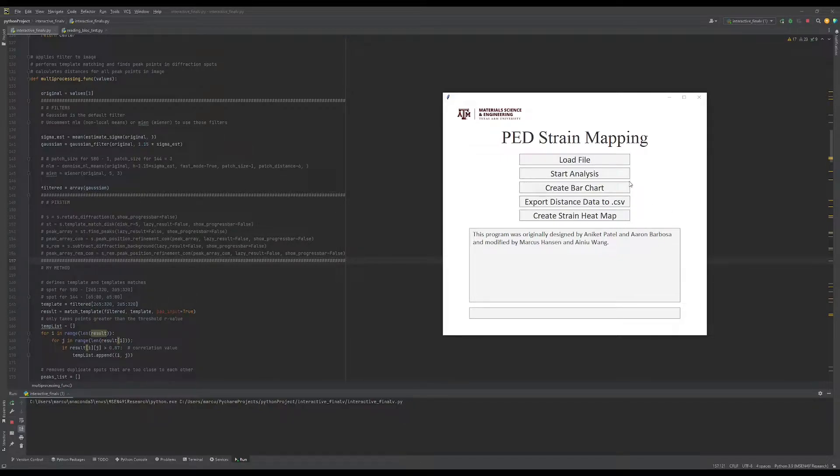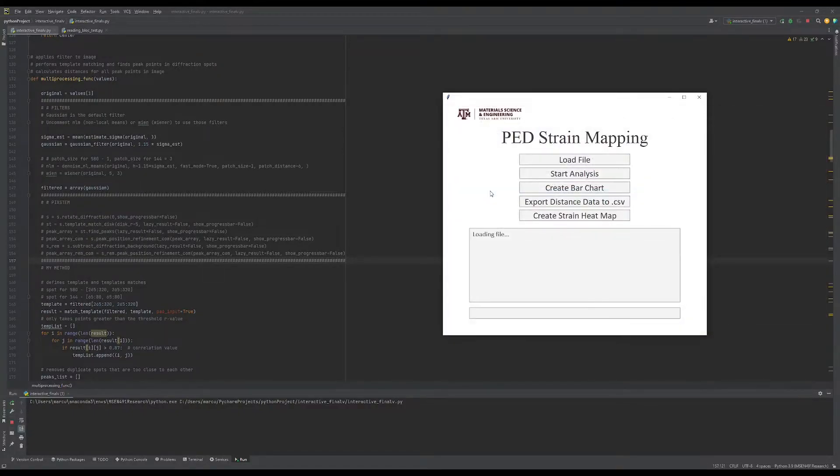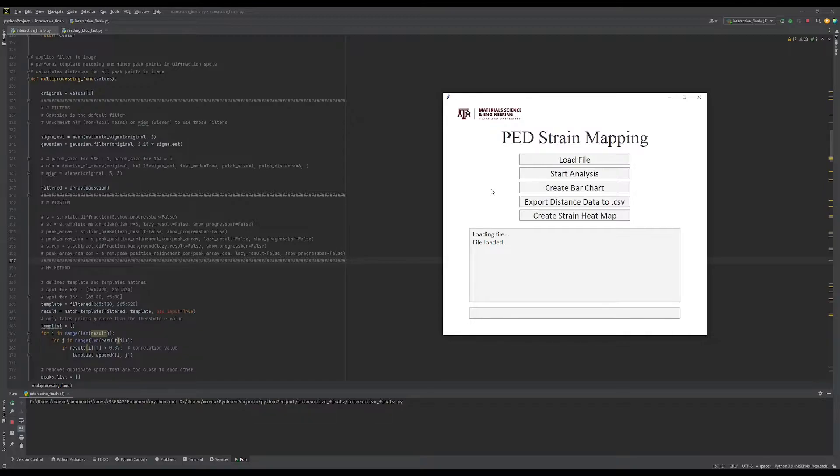To start, we'll load the block file. This can take a few seconds depending on the size of the file. Once the file has been loaded, click on Start Analysis.